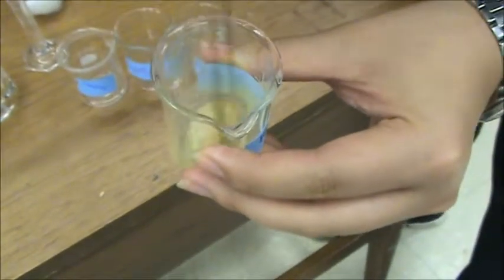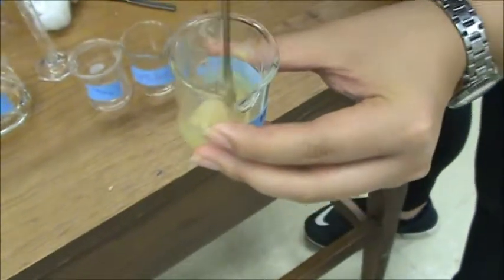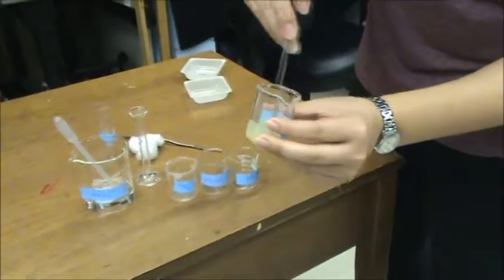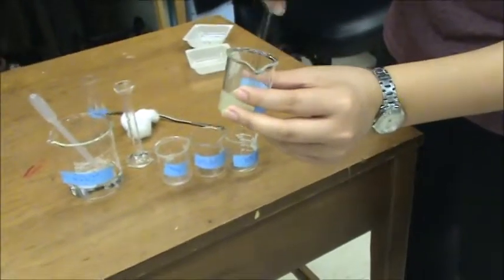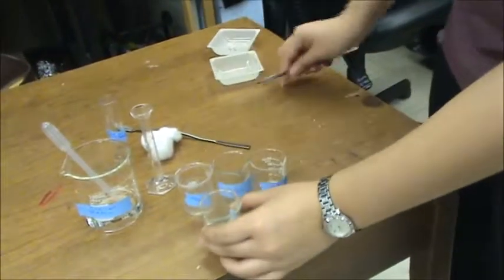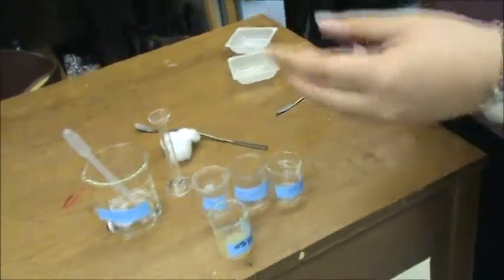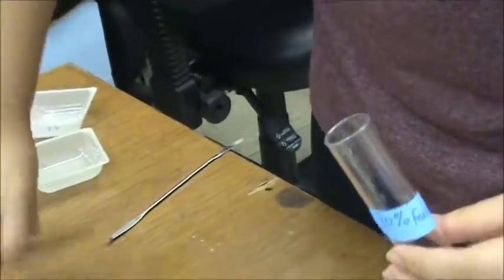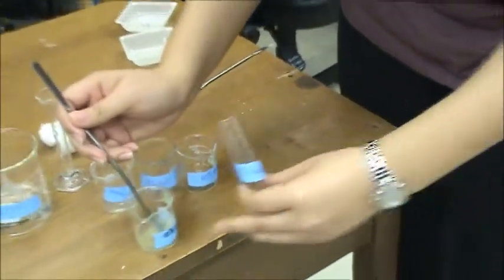And it doesn't take very long at all. After it's mixed together fairly well, you want to take your tube that your fly will be in and once again make sure that it's labeled. And then just take some of the food and put it in there.